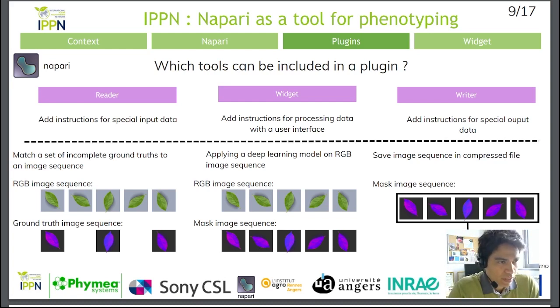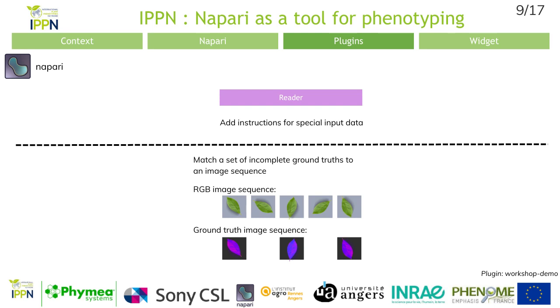For the Reader, a user may have data with a very specific structure. To make this data processable in Napari, the Reader offers the user the option of writing a script. For example, suppose you have a set of RGB images with an incomplete mask dataset. When you input them into Napari, you want each RGB image and mask to match. To do this, you need to write a script in the Reader method that matches the RGB image with its mask.